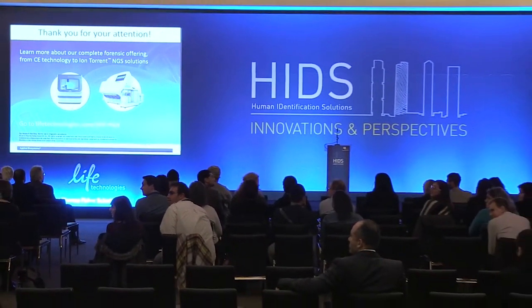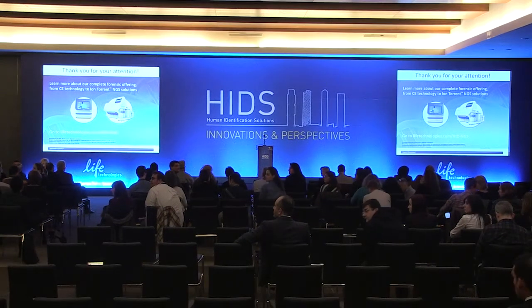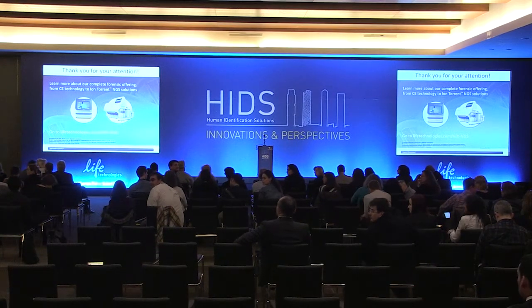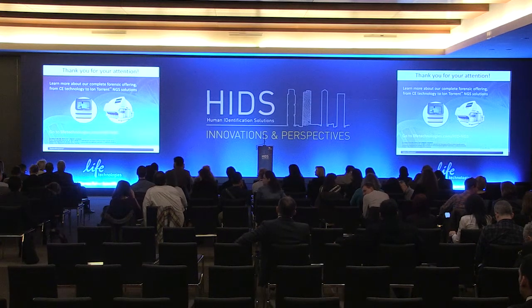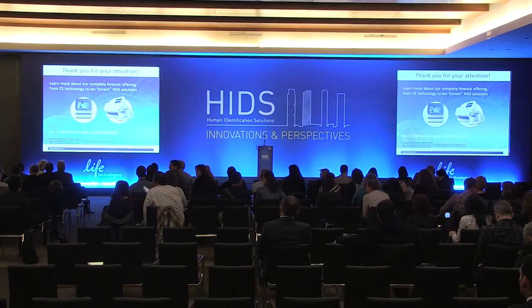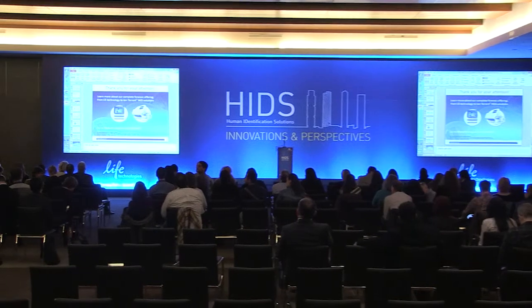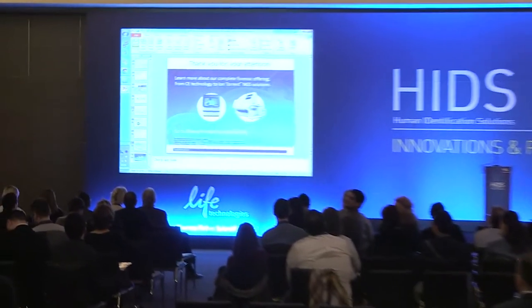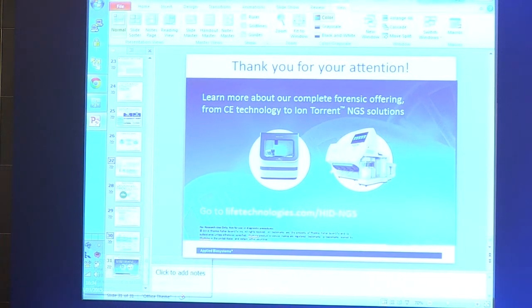I'm hiding over in the corner in case you can't see me. I'm over here not only to advance Philip's slides for him, but also so I can operate my computer and show you some detail of what PGM data actually looks like. To make it seem more real after all the presentations we've had today, I'm going to walk you through what PGM data actually looks like for a person in the lab.